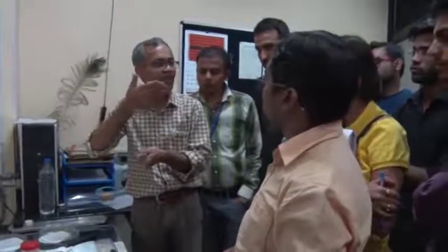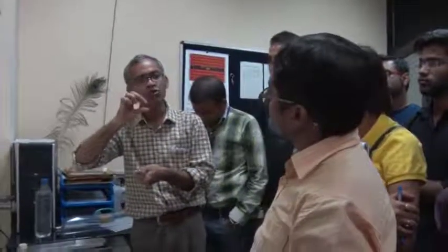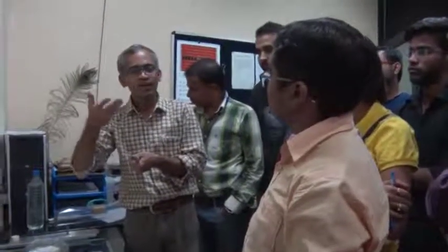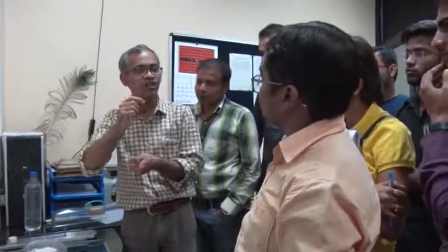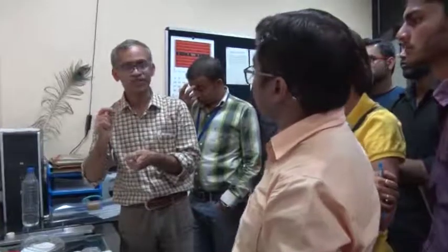So for dislocation analysis we saw that G dot B is equal to 0. So you make images wherein you choose two different two beam conditions and make bright field and dark field images from these two beam conditions, and identify at least 3 G reflections on which the dislocation vanishes. Then you can identify or calculate the Burgers vector.